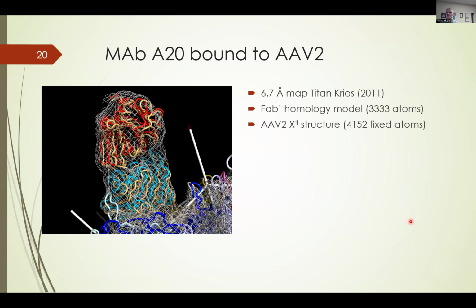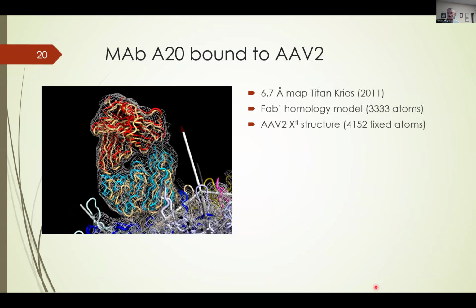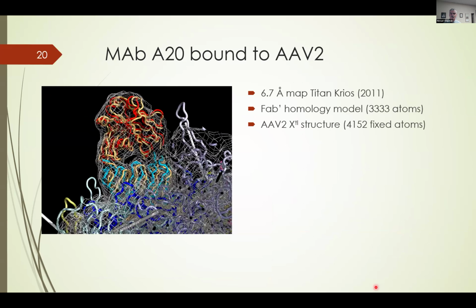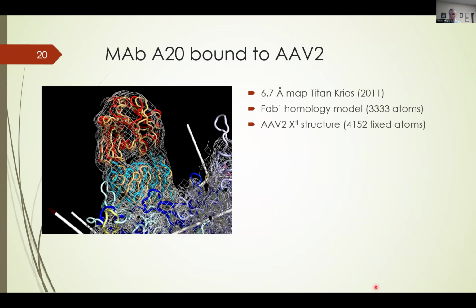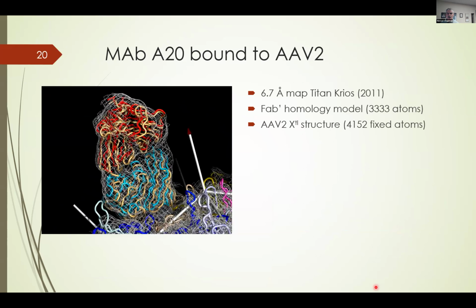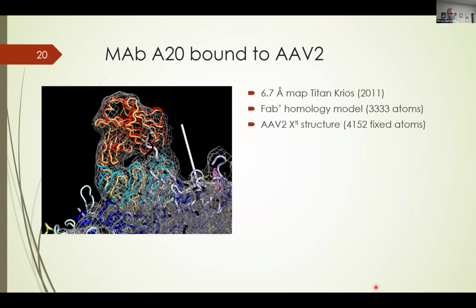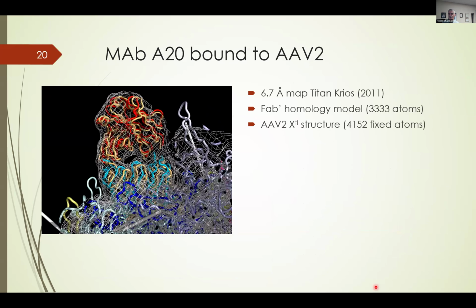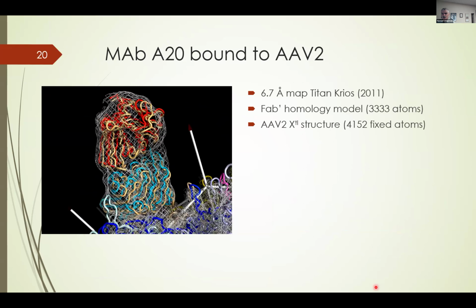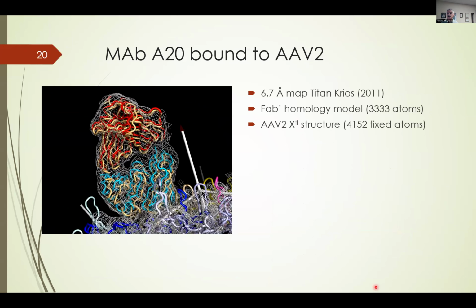And we hope to learn enough about the fundamental structural biology to be a foundation for the design of more efficient vectors. I'm going to run you through several examples of EM structures and their refinements in chronological order. And so we start by going back 14 years to a nanometer level structure.